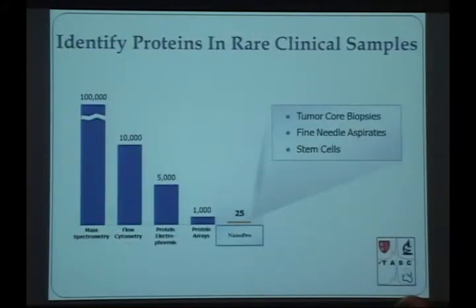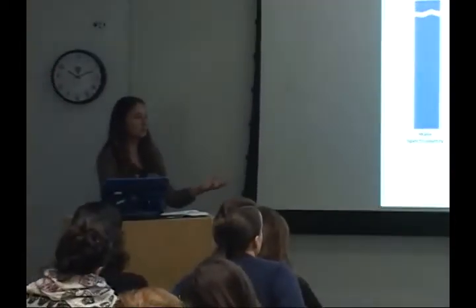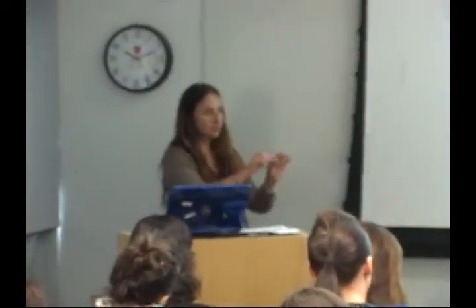So all these reactions happen within the capillary? They all happen within the capillary. You essentially start with the plate. You load the plate with the specific reagents that will be used for the assay, including your protein samples.